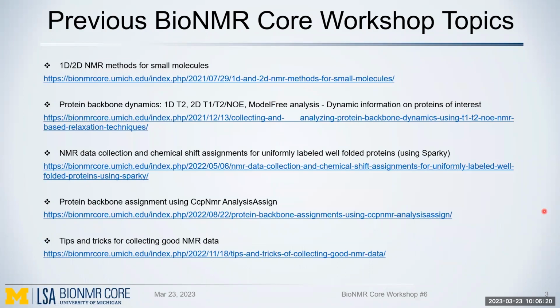And starting 2 years ago, we started to hold regularly those BioNMR core workshops. And so far, there are 5 workshops that are available on our BioNMR core website, and those video links are listed here. We've done workshops on 1D and 2D NMR methods for small molecules, protein backbone dynamics, and there are 2 workshops on protein backbone assignments, one on using Sparky to do the assignments, and the other on using CCPNMR Analysis Assign. And the latest one is done by Deb on tips and tricks for collecting good NMR data.